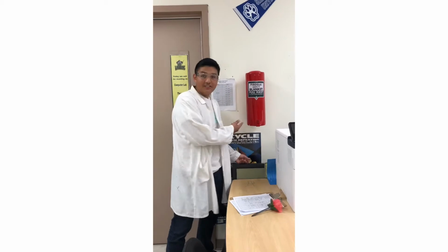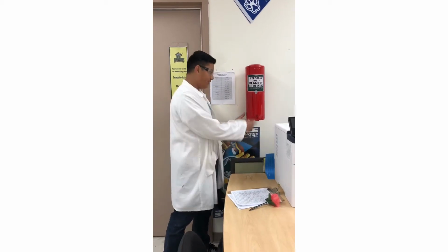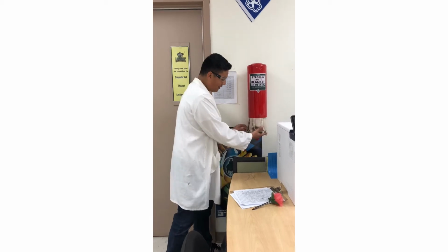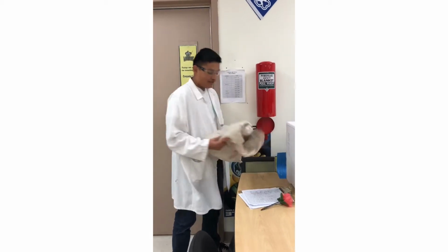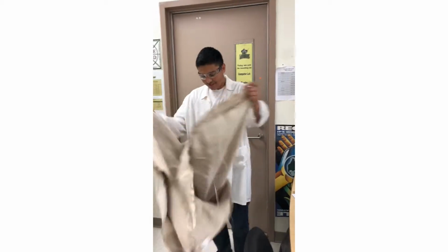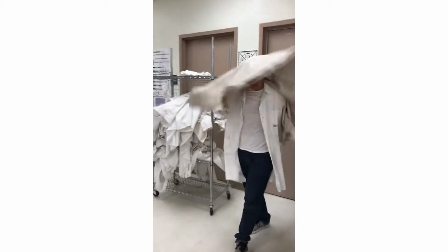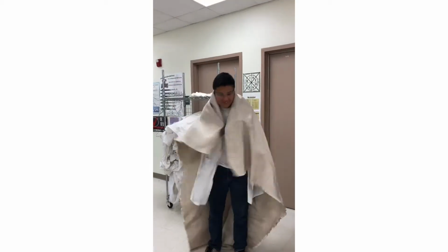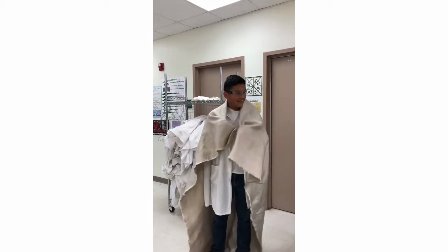In case of a fire emergency and someone's on fire, this is your fire blanket. To get it out, you just flip this, open it, then you just unravel it. And then you stop, drop.